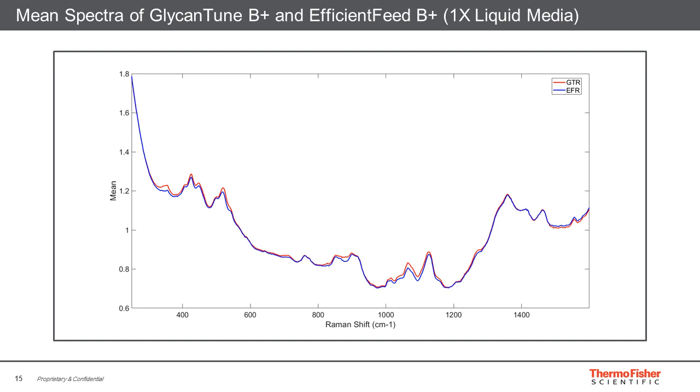And we can see that reconstituting the medias greatly reduces the overall spectral quality for both medias compared to the dry powdered form. But even so, we can see small spectral differences around 300 wave numbers, very subtle differences near 500 inverse centimeters, and some more apparent differences closer to 900 wave numbers. But let's pre-process the data, pull out even more of those subtle differences.